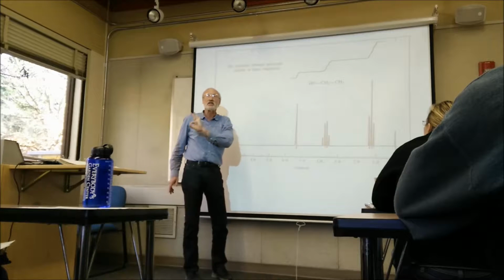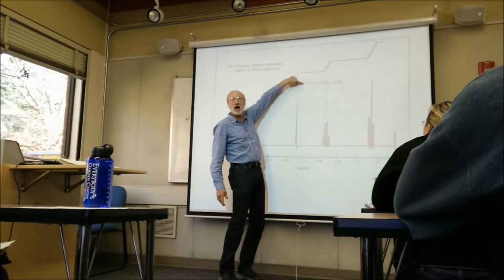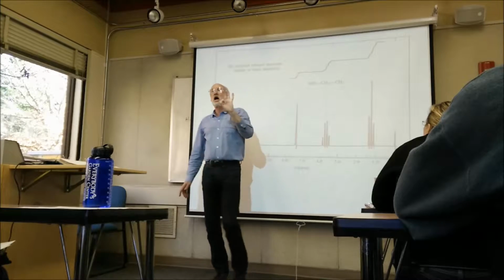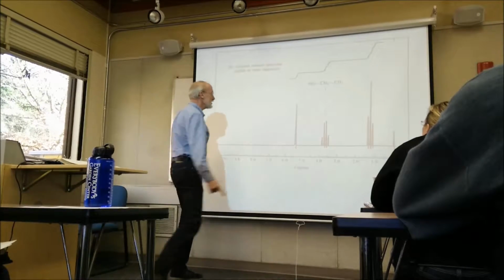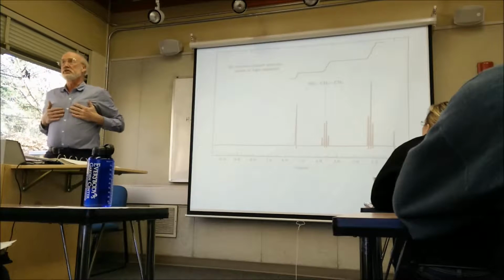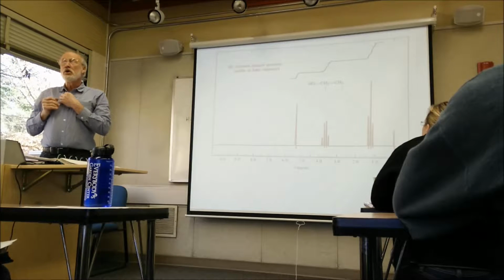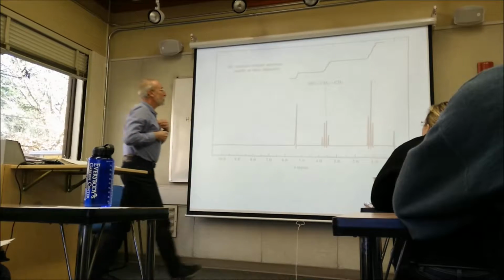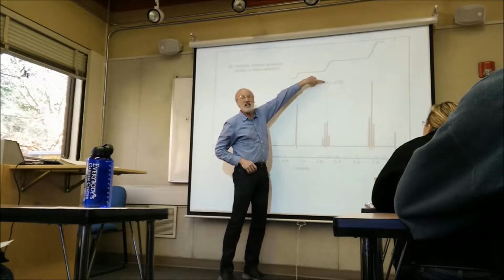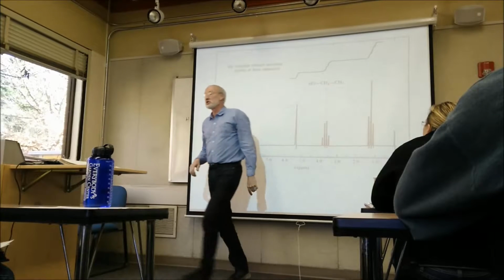What's happening is in the presence of acid or base, it catalyzes this proton coming on and off and on and off. And if it's coming on and off at a frequency that's higher than the frequency at which this thing resonates, it decouples it. So when you see hydrogens on oxygen or nitrogen, it is very typical for there to be no splitting, and you'll notice that these no longer split these. This thing is now a simple quartet, split by those.